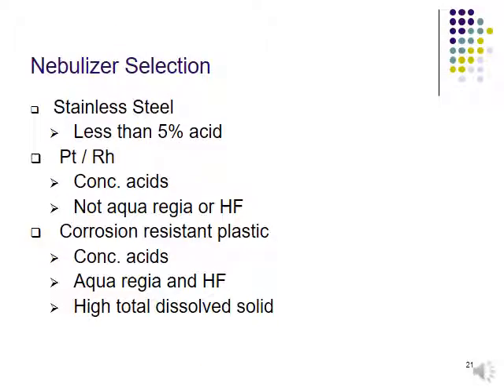Next we talk about nebulizer selection. When we want to choose a nebulizer, we can choose stainless steel, because stainless steel at high temperature is still considered stable. That's why we choose stainless steel.